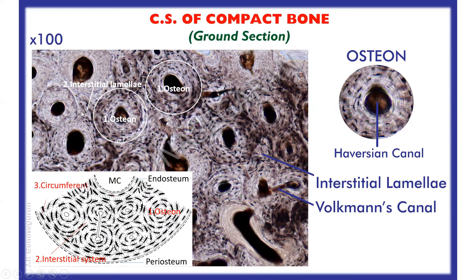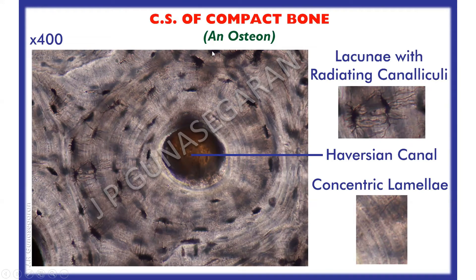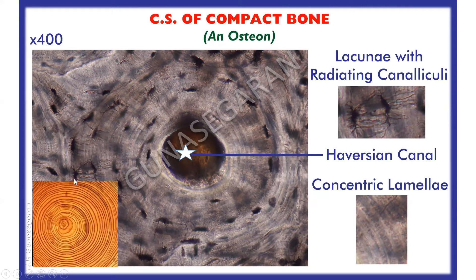The third component is the circumferential system. You have an inner circumferential system and an outer circumferential system — the inner is deep to the endosteum, and the outer is deep to the periosteum. This is a higher magnification of an osteon, traversed by a central canal known as the Haversian canal. The Haversian canal is surrounded by concentric lamellae of bone, resembling the growth rings of a trunk of a tree.